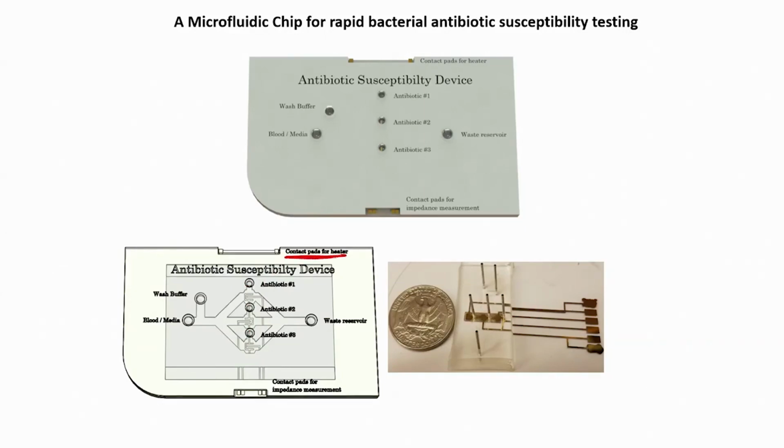You can see here contact pads for the heater. And on the top we have designed the microchannels with the help of PDMS. We have performed soft lithography. You can see the device here, and this is the outlet, this is the inlet, because we have the design in this particular format.